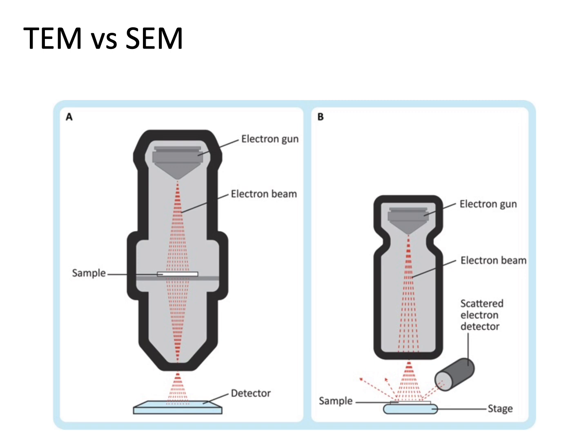to materials that you're interested in, because as that electron beam hits the sample, right, some electrons will go through and give a lot of signal, but some areas of your sample will be made to be electron dense and block the electrons. So there'll be less of them to go through to the detector, and that's how you see your image.